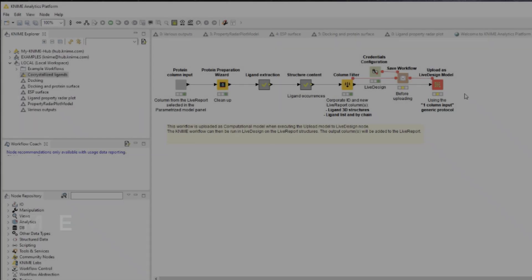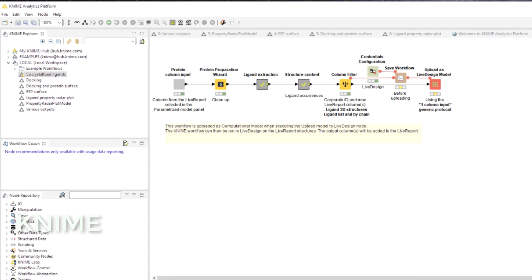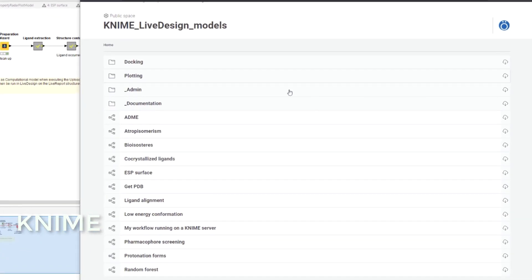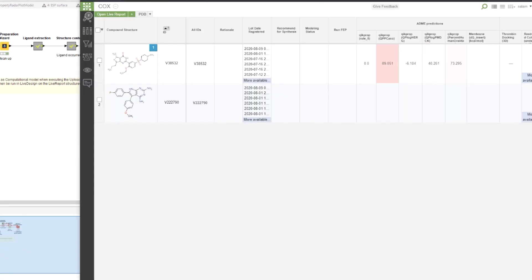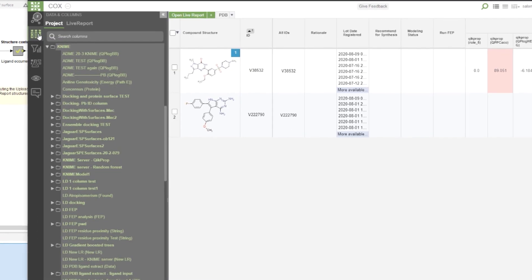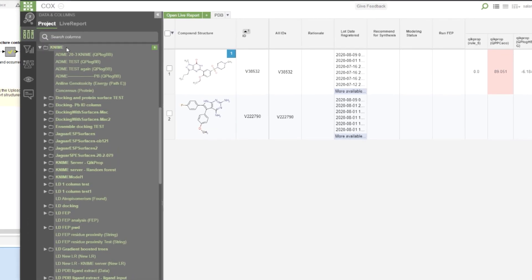And finally, over in KNIME, the collection of live design specific KNIME workflows continues to grow. Once downloaded, these can be added to the live design as new models.